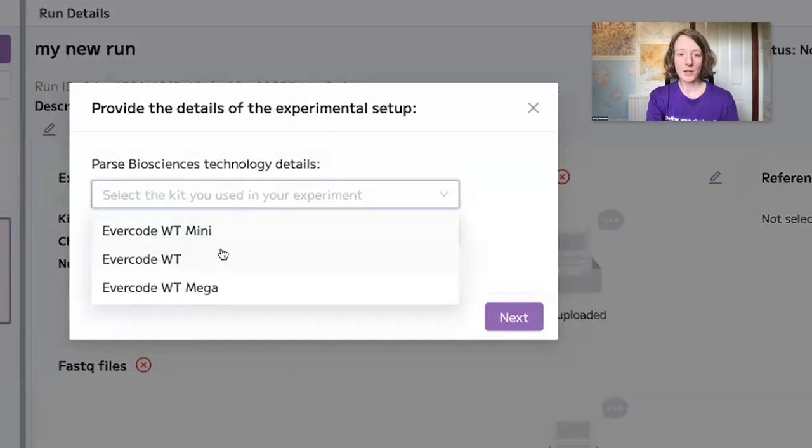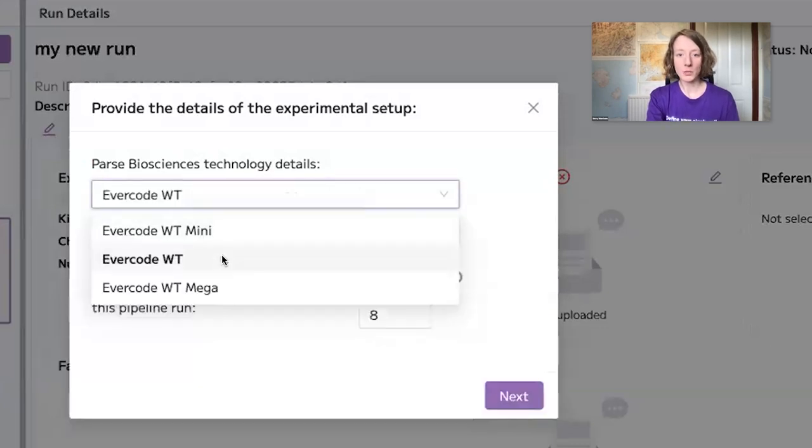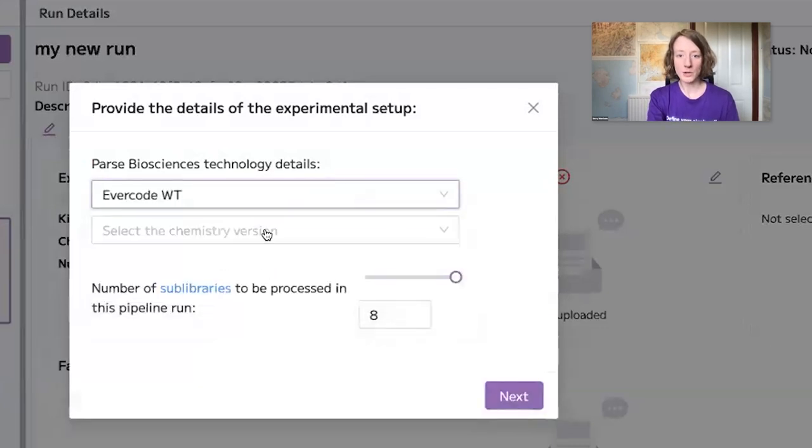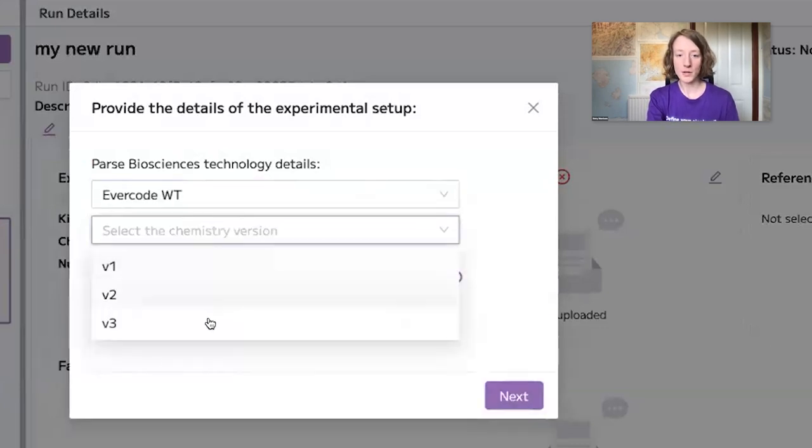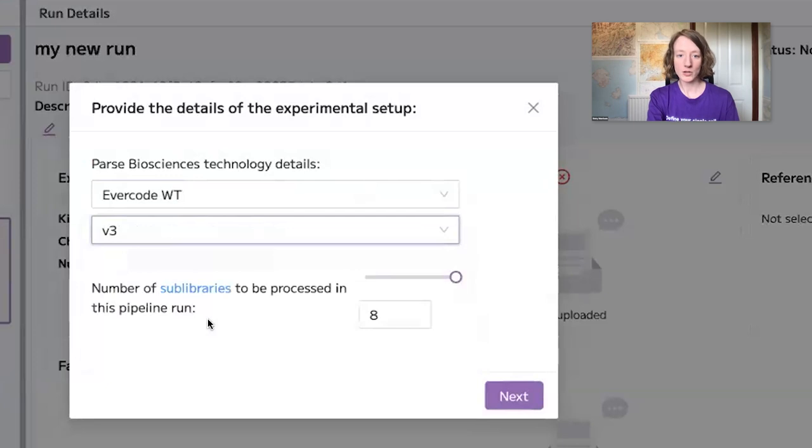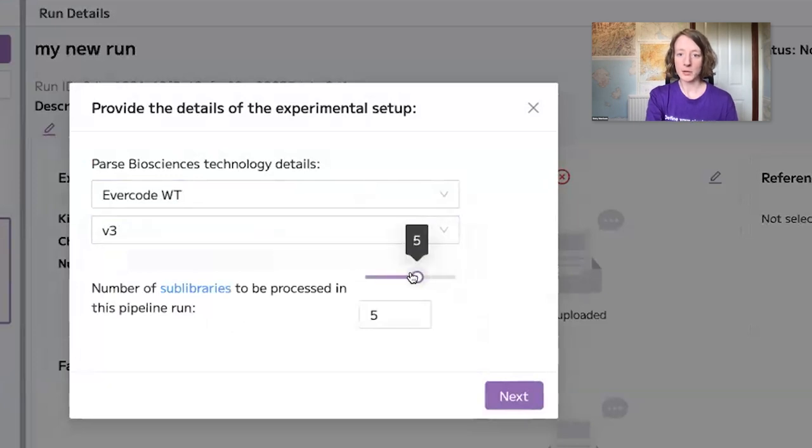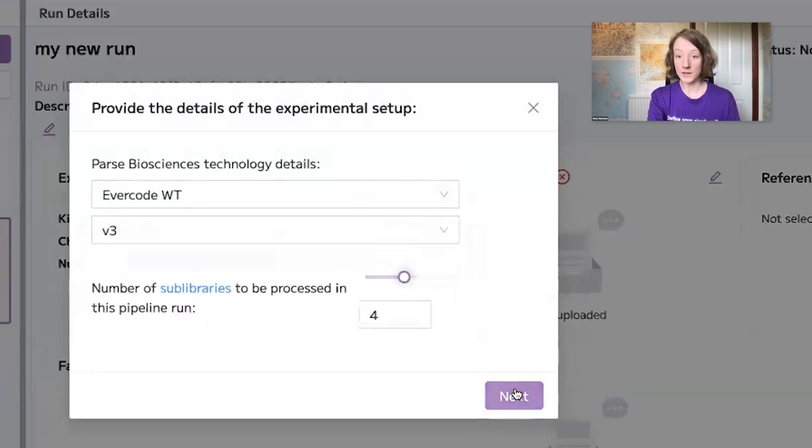For example, you would select which kit you used in your experiment, which version of chemistry you used, and how many sub-libraries you would like to process within this particular pipeline run.